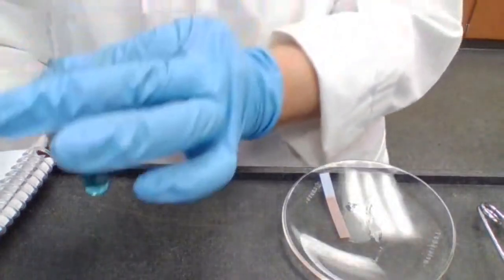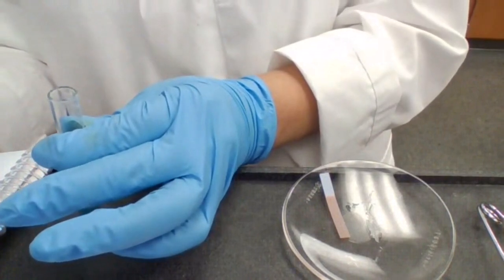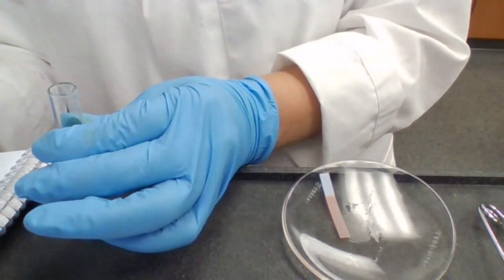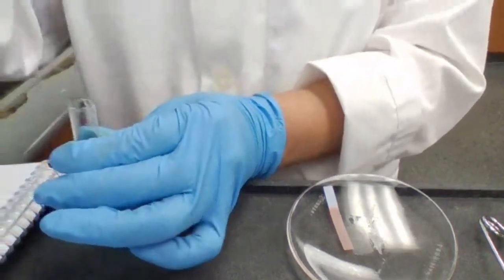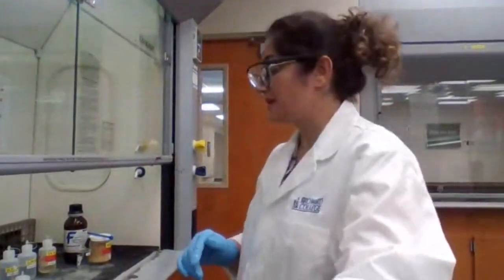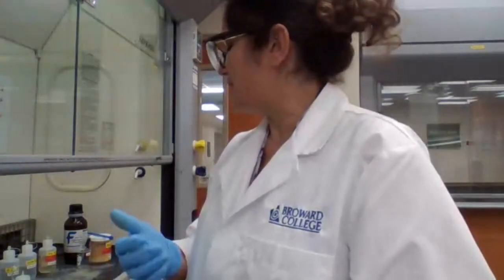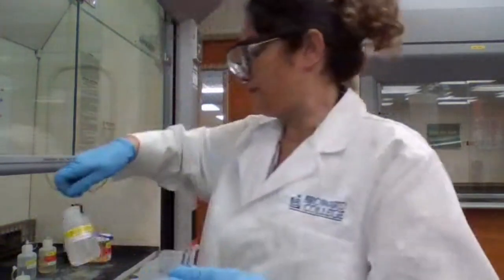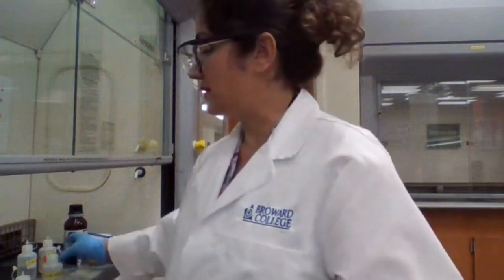Okay, when the solution is acidic, you're going to add 2 drops of potassium ferrocyanide and observe formation of the maroon precipitate. That maroon precipitate has given some trouble to other students in the past, but let's see what's going to happen today, because we usually don't get that maroon color. We get like a beige color. So we are going to add the potassium ferrocyanide.